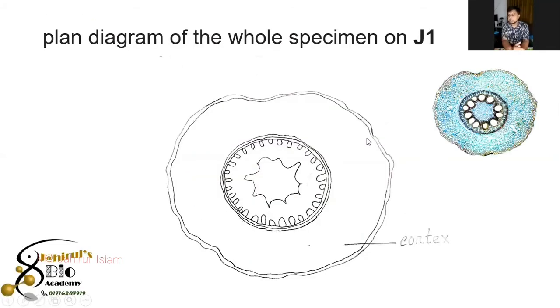Okay, this is the picture I have drawn for you. The picture will look like this. So you see, I have given the picture beside it, so that you can understand. The epidermal layer you see, this is for epidermis, and this is for cortex, endodermis, and then after that the inner part is phloem, and this part is showing xylem, and this part is for showing phloem.